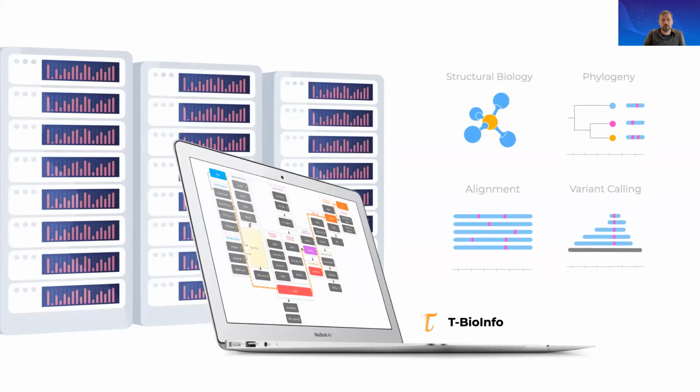And those will include alignment of reads to identify specific variants in positions according to their position on the reference DNA. They deal with variant calling, how to distinguish between random changes that are a result of maybe some changes that happen because of sequencing errors from actual variants and categorize them, as well as other downstream methods of analysis like phylogenetic analysis, mutability analysis, and others.